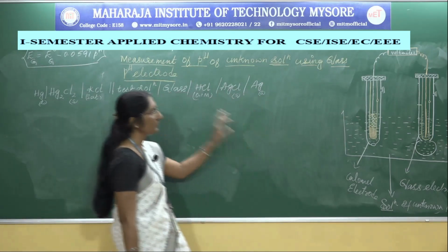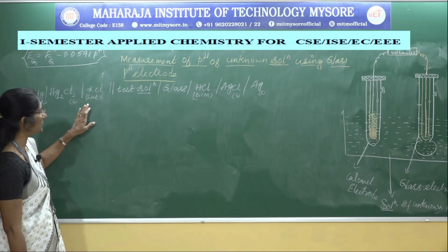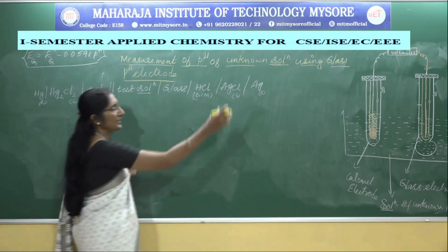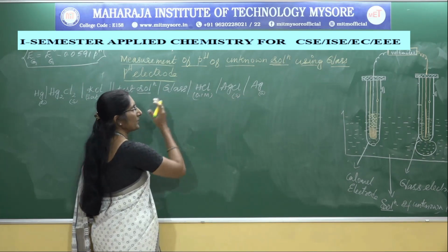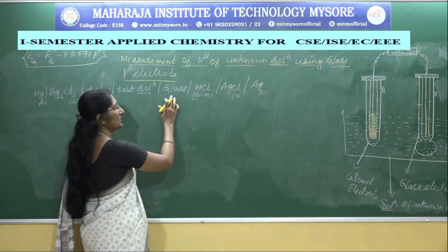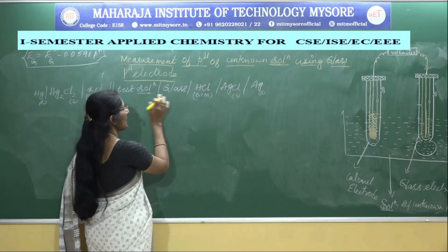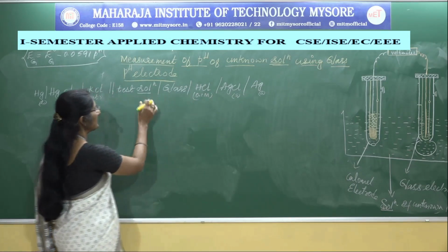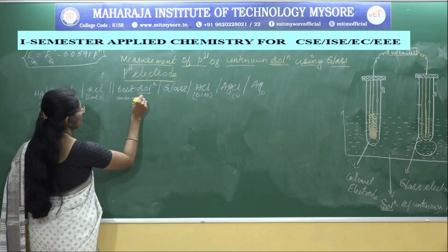According to this diagram, the calomel electrode acts as an anode. Therefore first we have to mention the anode representation. Then the glass electrode acts as a cathode, so we have to represent the cathode. The cathode is the glass electrode. Its representation is glass, HCl, AgCl and Ag. So exchange of ions takes place with this test solution, which is of unknown pH.